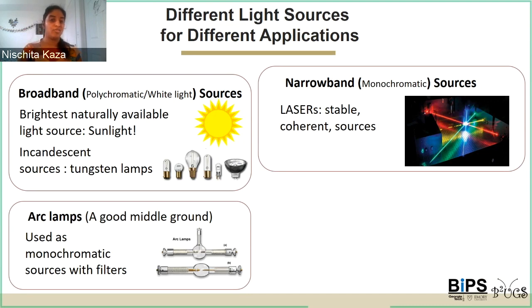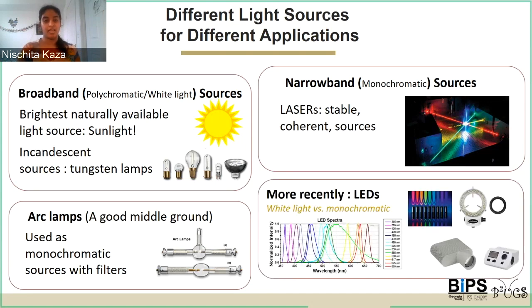Of late, though, these have fallen out of favor because they tend to need to be replaced pretty frequently, and also they're often made of hazardous materials, so disposal is an issue. Finally, especially in recent times, LEDs have become extremely popular for a wide variety of different applications.